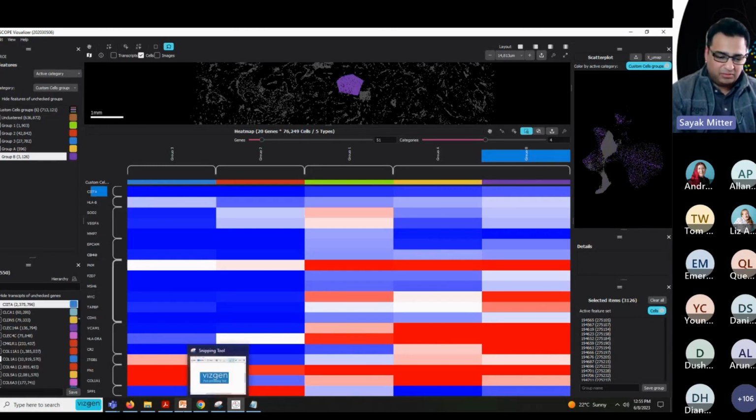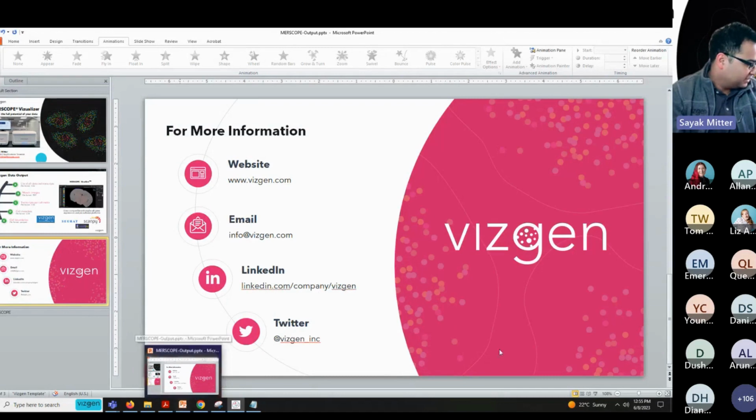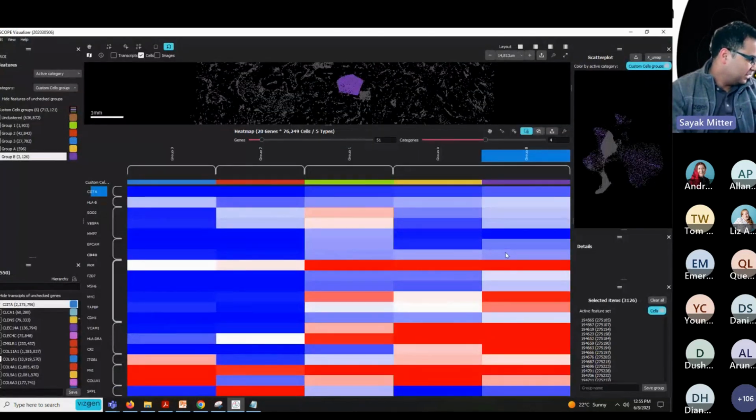So these are the key pieces of information that I wanted to cover. I think I have about 5 minutes left, and there are a few questions that I see here in the chat. Please feel free to ask more questions.